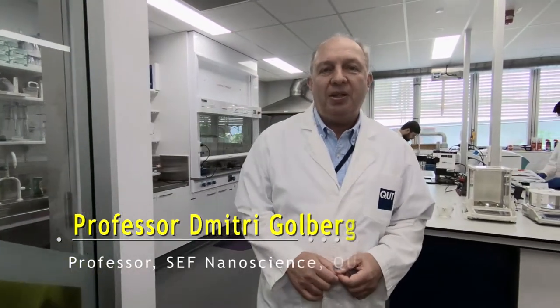Hello, I'm Dmitry, head of this laboratory, and today we will show you how we make nanomaterials by using chemical vapor deposition.